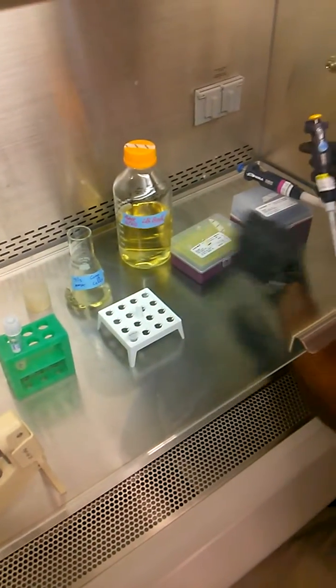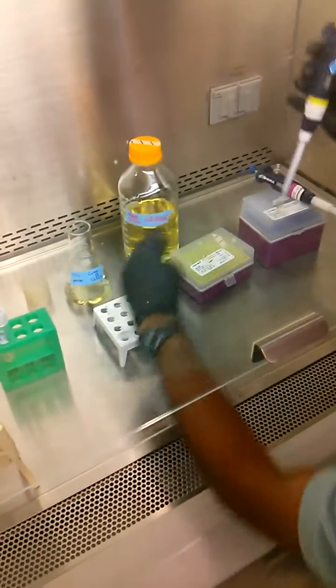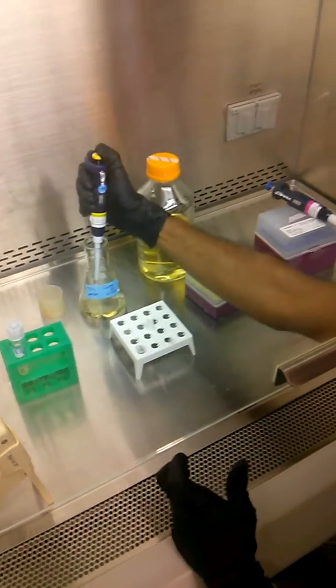My cells are resistant to kanamycin, so I'll add 50 microliters of kanamycin into the comp cells.